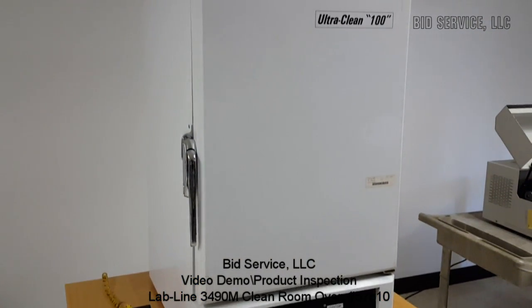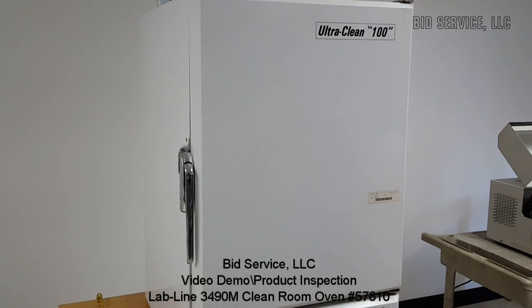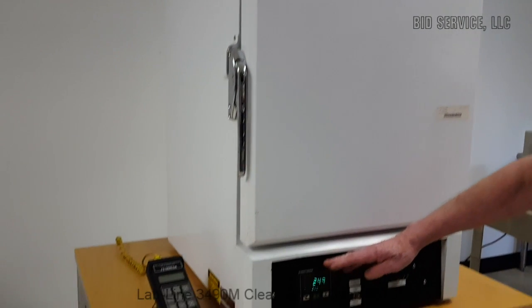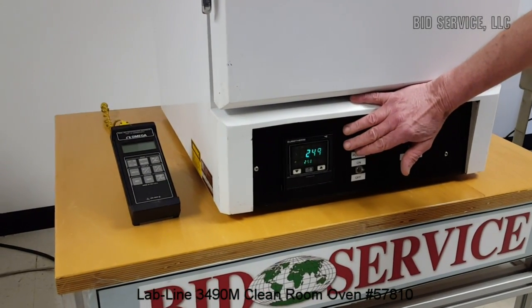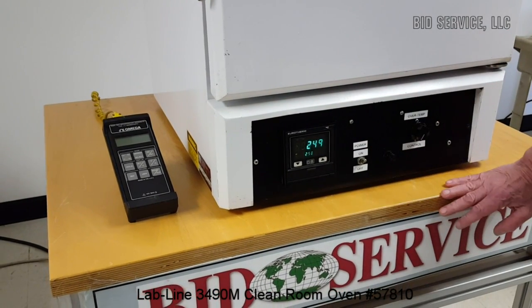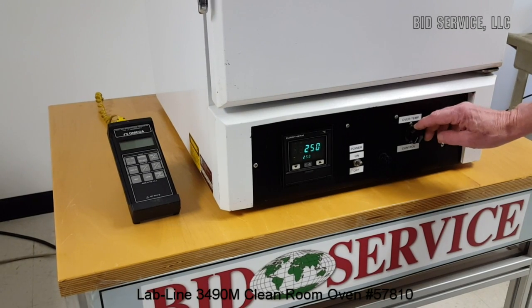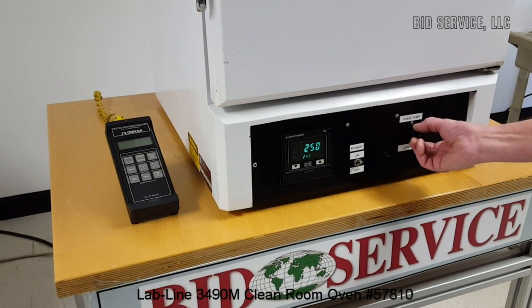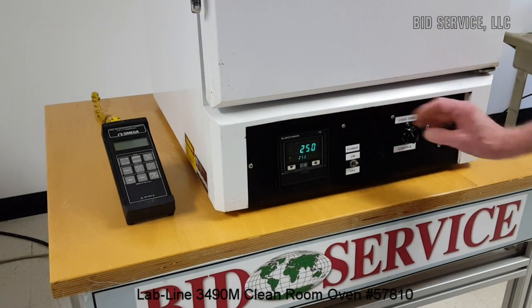This is the Lab-Line Ultra Clean 100 clean room oven. It has a digital controller and a temperature range from ambient room temperature to 250 degrees C. It also has an over-temp controller that you can set to turn off the heaters at a specific temperature if you do not want it to go over that.